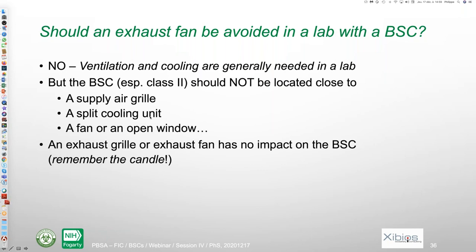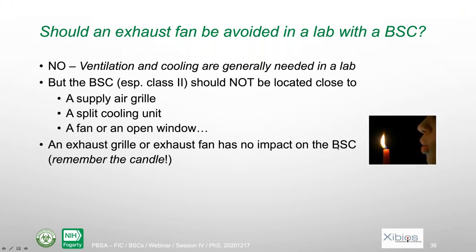A split cooling unit, so those small units that blow cold air into the room, or a fan or an open window. On the other hand, an exhaust grill or exhaust fan has no impact on the biosafety cabinet, so you can have it above the cabinet. So remember the candle, you can extinguish it by blowing, but not by pulling the air.